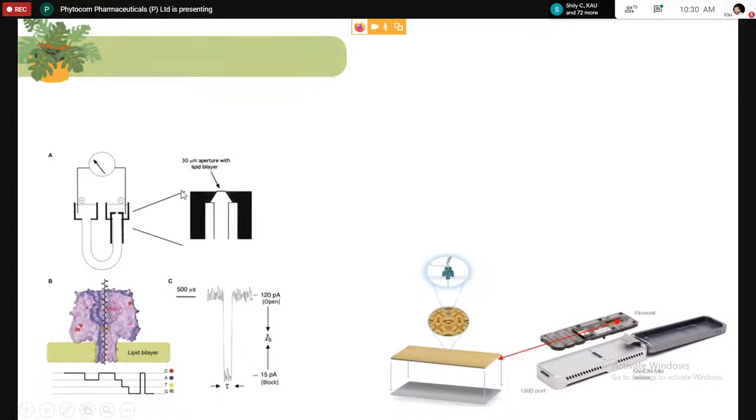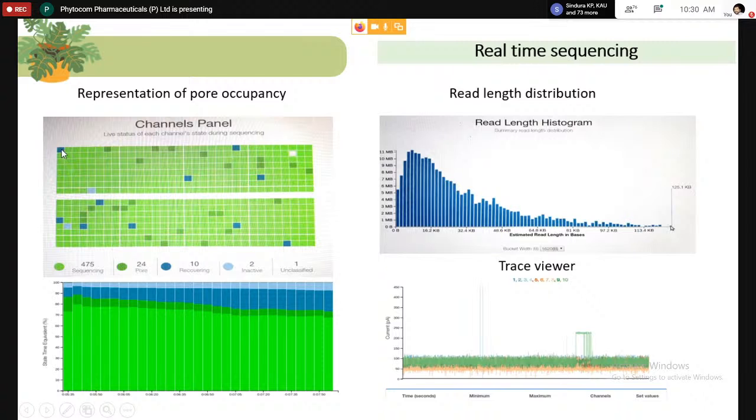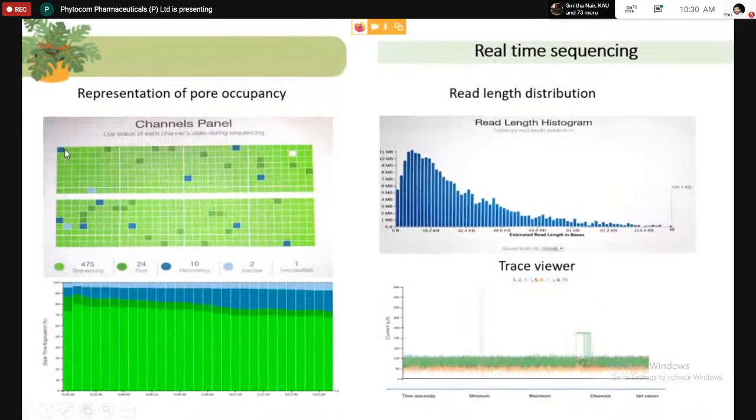This is how a pore looks like. In this region the MspA is loaded. Like this, you can see 4 channels here. When you see the flow cell of the MinION, there will be 512 channels. In each channel there will be 4 pores. Among the 4 pores, one pore will be actively sequencing the DNA, and not all the pores will be sequencing at a time.